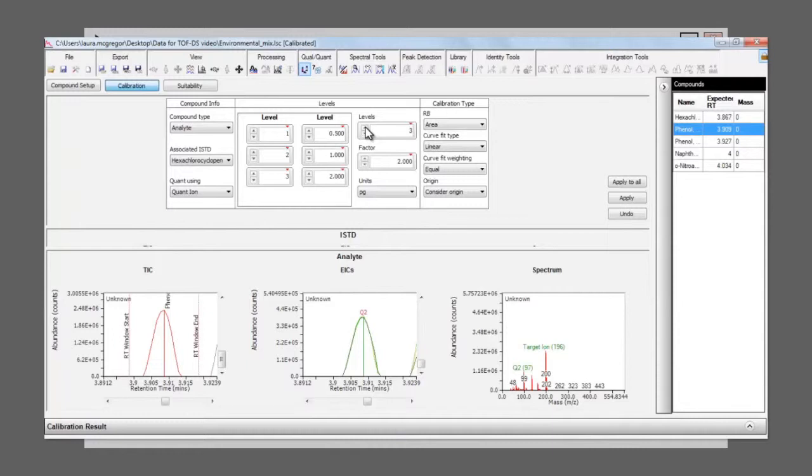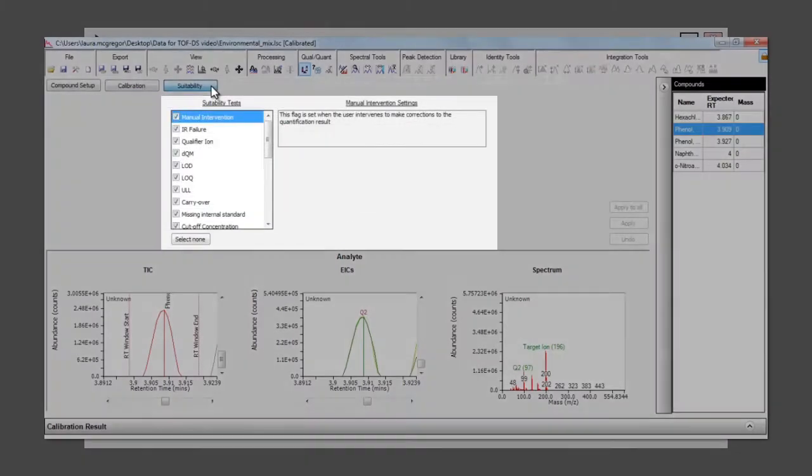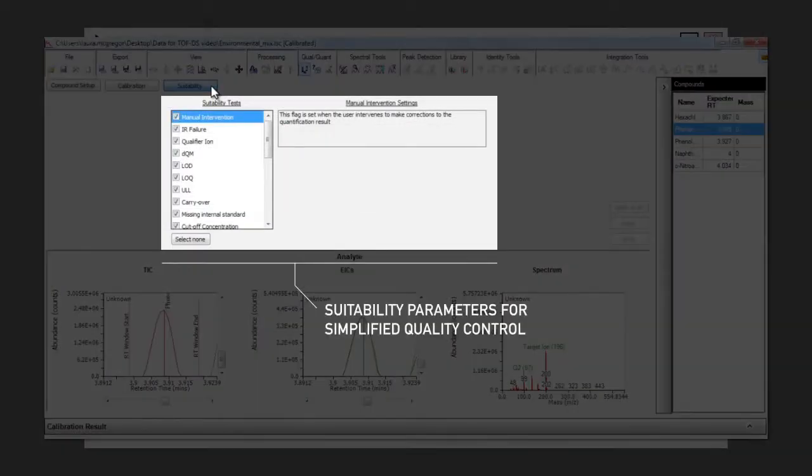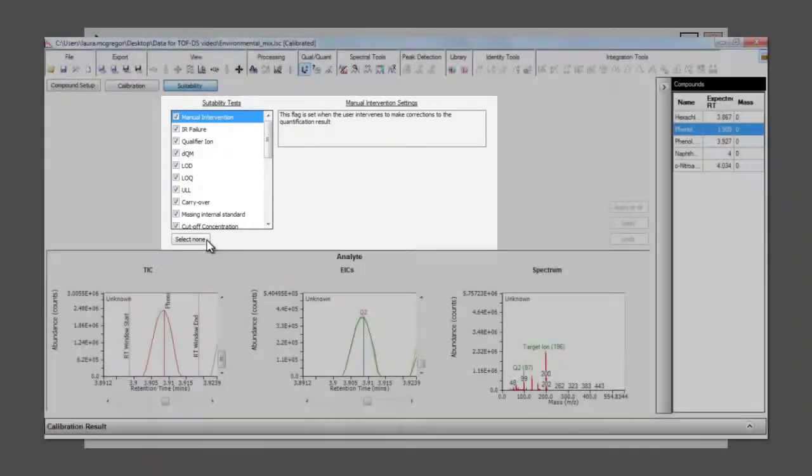Applying these settings to all compounds means that the quant method is almost ready to use. The final step is to define suitability parameters, and it's up to you how many of these you'd like to apply.